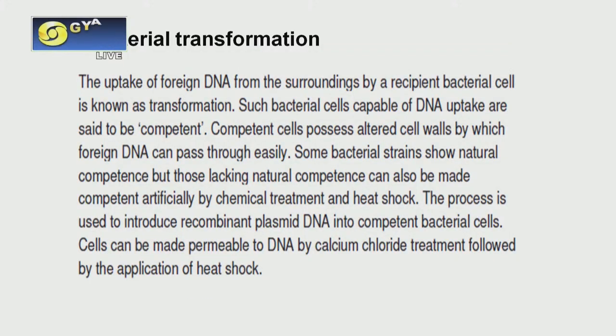But the last part of the experiment is the preparation of competent cells and bacterial transformation. Now, why do we need this experiment? Whether your ligation reaction is properly successful or not can be monitored only through transformation. Moreover, what is the purpose of knowing transformation? Supposing you need to incorporate a plasmid DNA in a bacterial cell, in that case you have to undergo transformation. What is meant by transformation? It is the uptake of foreign DNA by a bacterial cell.